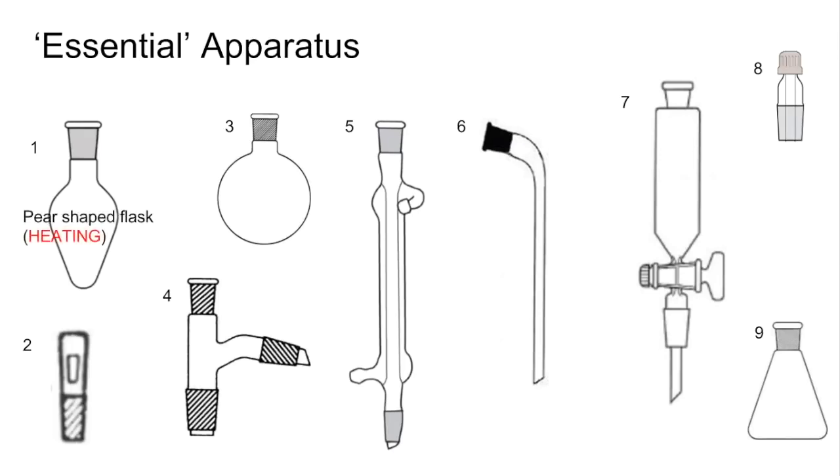Number one is a pear-shaped flask, which is used for heating. Number two is a glass stopper. Number three is a round bottom flask, which is also used for heating. Number four is what we call a still head — I'll come back to that in a moment.